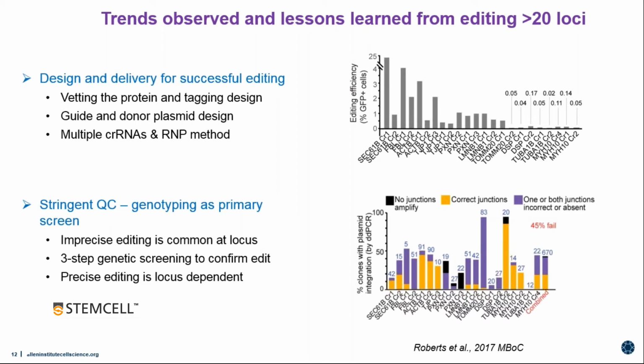And you can see here, if we had just done junctional assays, a lot of them would have actually not been precisely edited. So that's just a warning, and it depends on what you use these cells for and what kind of assay. But just to know that if you're creating a double-strand break, there's a lot that happens at that locus, so to keep that in mind.